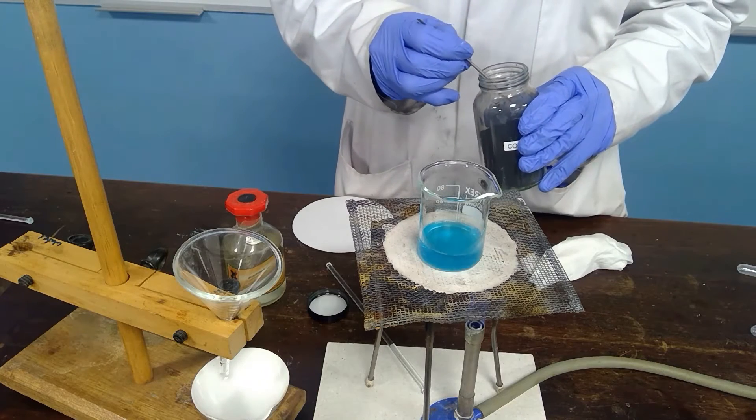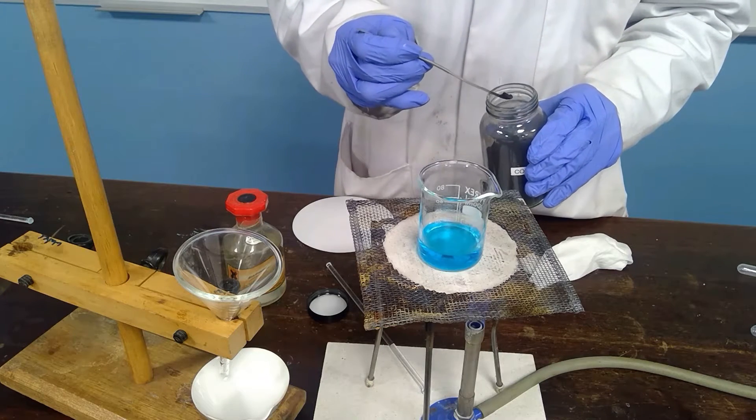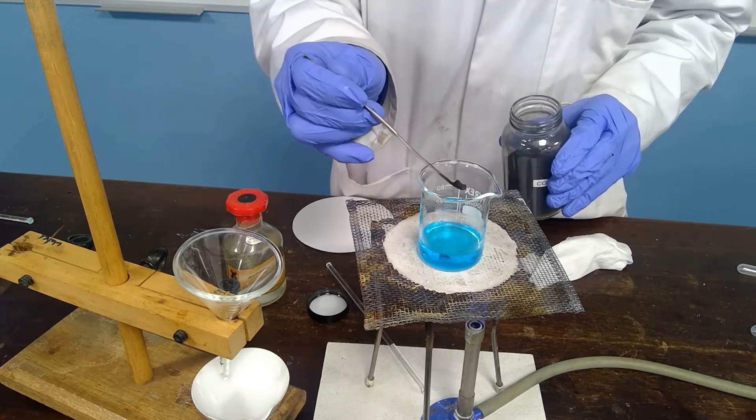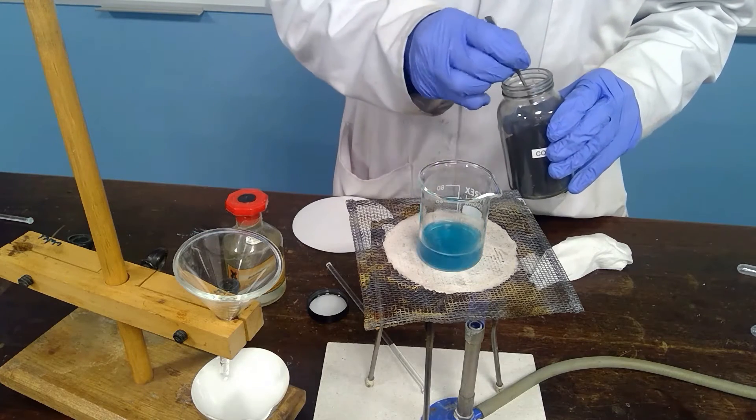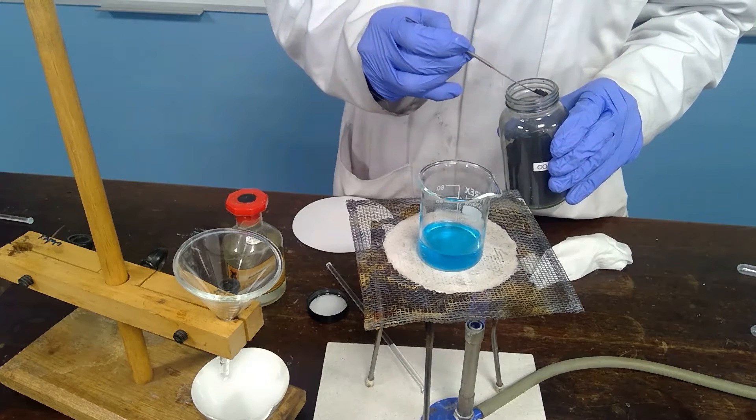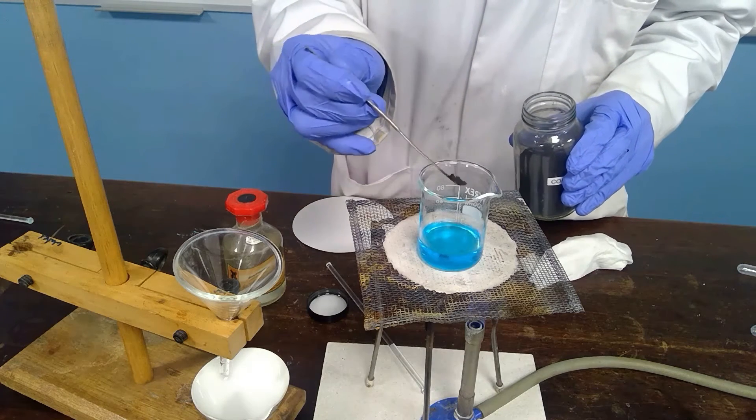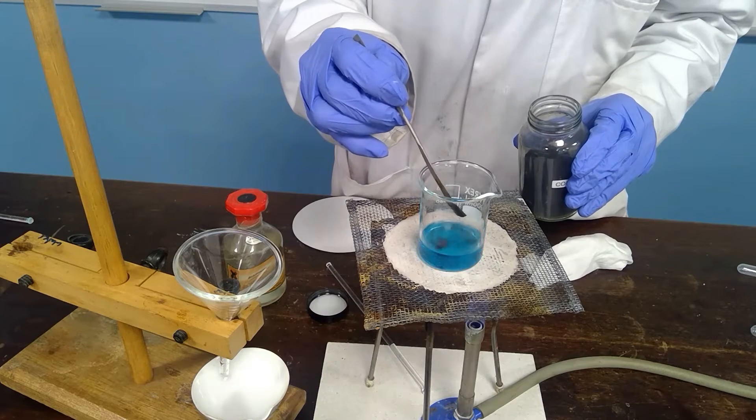As it reacts it disappears. It disappears because it reacts with the sulfuric acid so we know at this point that we definitely have an excess of sulfuric acid. Each time we add the black copper oxide it reacts to form the blue copper sulfate.